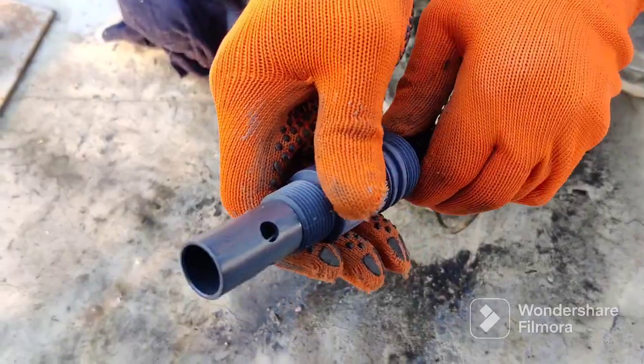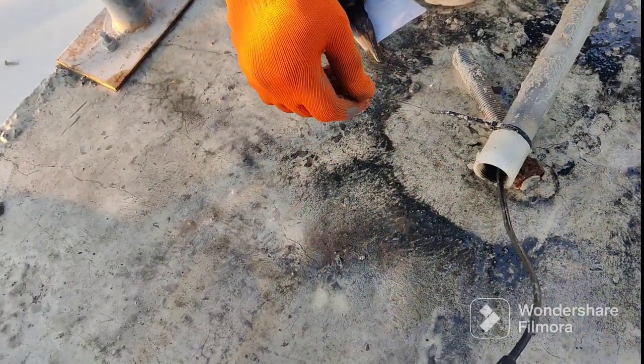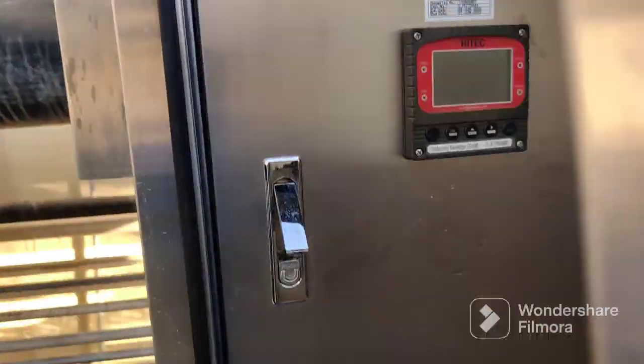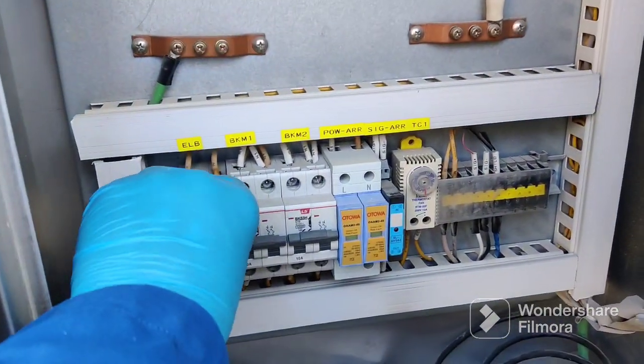Look at this — now we are connecting the new one. The old one is already removed and this is the new one. We will fix it inside and it must be fixed properly. Then we can check from the electrical panel. Now it's closed. We switch on the breaker.